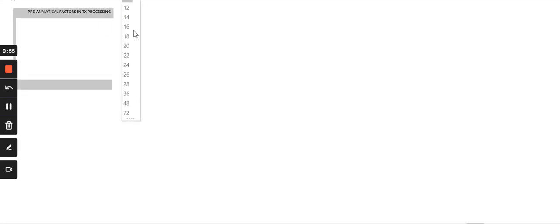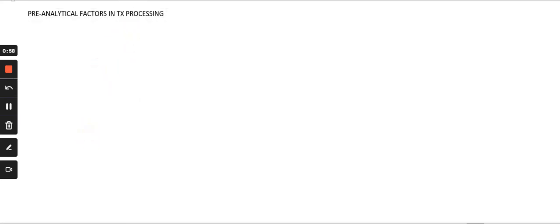So let's start, okay? Now for our fixation, before we proceed to our fixation, we have this thing called pre-analytical factors in tissue processing, right? As you have learned in your third year, if you can recall, we have factors in our pre-analytical phase, our analytical, and our post-analytical phase.